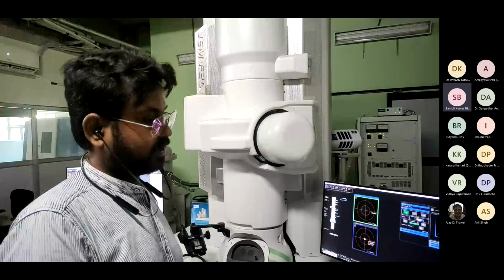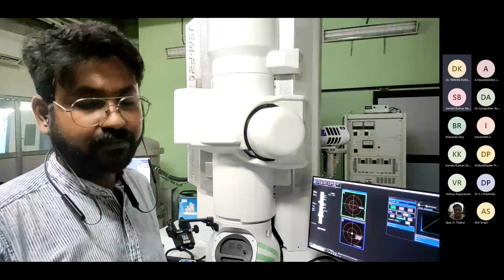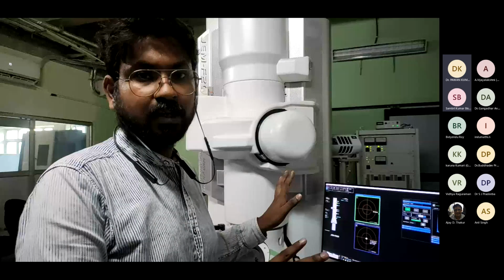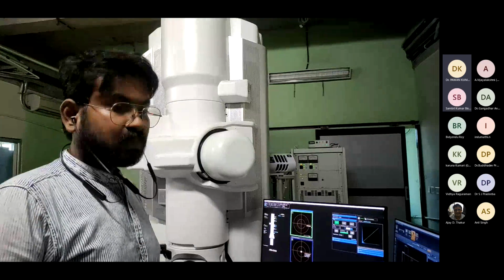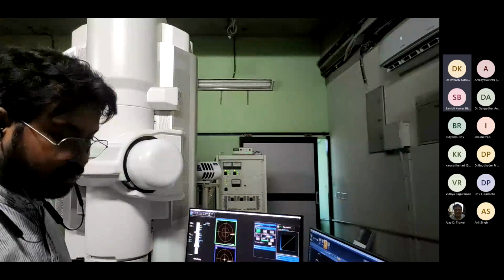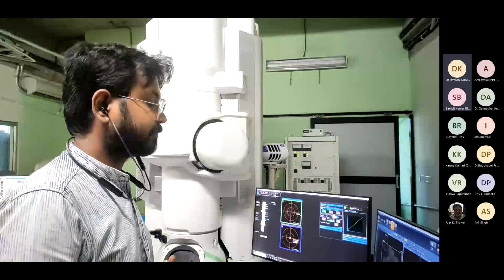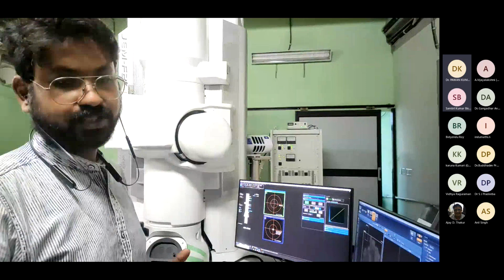It has more potential, and different analyses like SAED and other things we can do. Dark fielding. Right now, till now, I have done only the bright field imaging. Dark field is the one thing left. So it has more features to do different analyses also, obviously. These are the basic models we have in our department. So TEM, SAED, HRTEM and EDX analysis you can perform here.